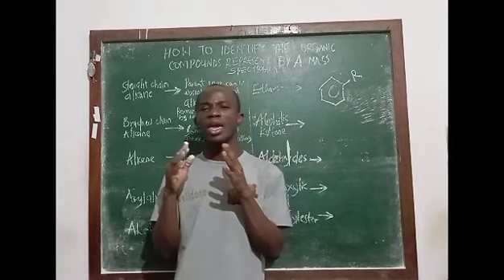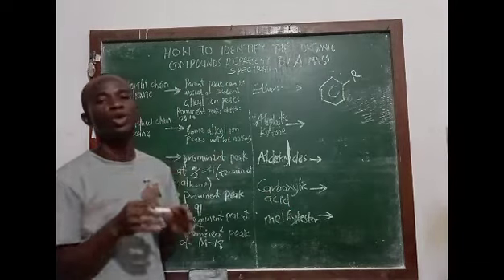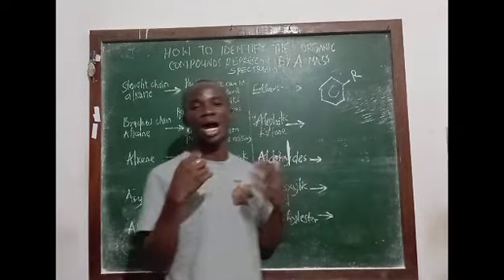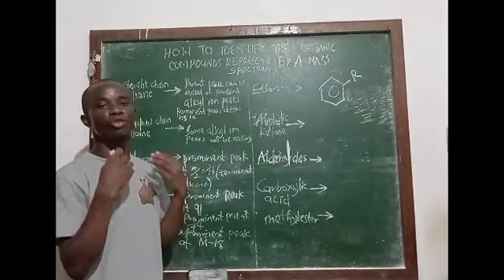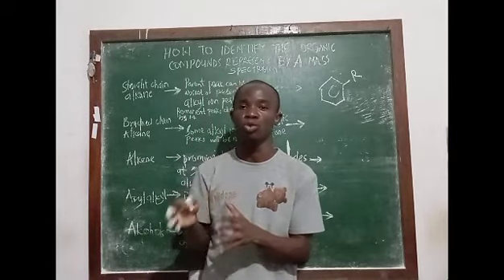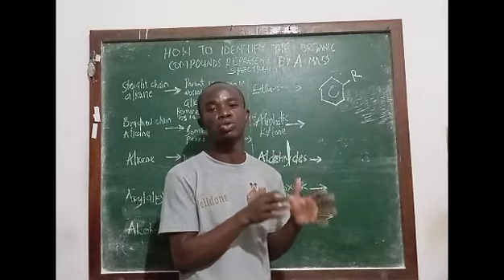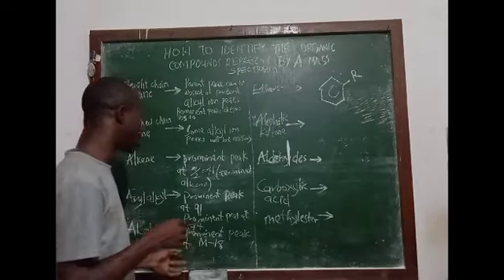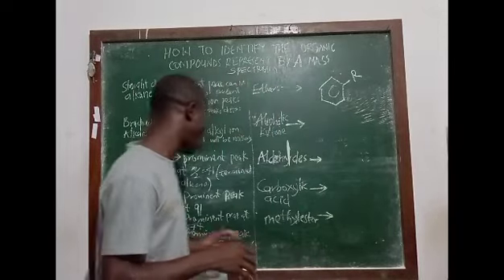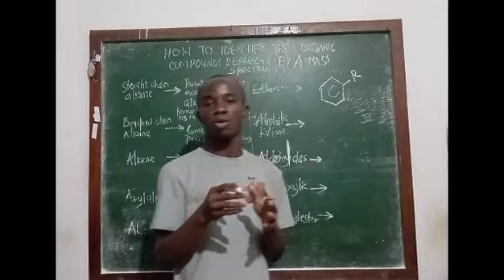So in a mass spectrum that represents an alcohol, you should always see an M minus 18 peak, because from an alcohol we can always remove H2O and have the remaining part of the molecule as a cation, and that's how we have a peak at M minus 18. But this particular peak is only found in alcohols.